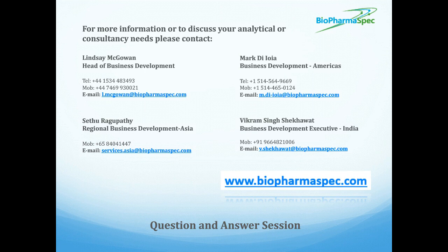That's great. Thank you so much. Okay, and the second question of today is, can I replace one of my ELISA methods, i.e. the kit or the custom-developed ELISA, with a mass spec-based method?